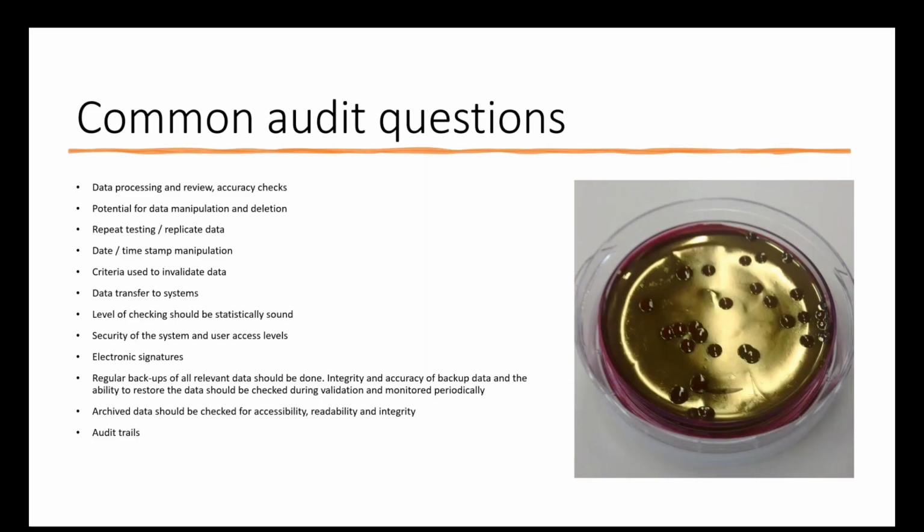So what time was the sample taken? What's the unit of measurement? All this kind of supporting data is equally as important.